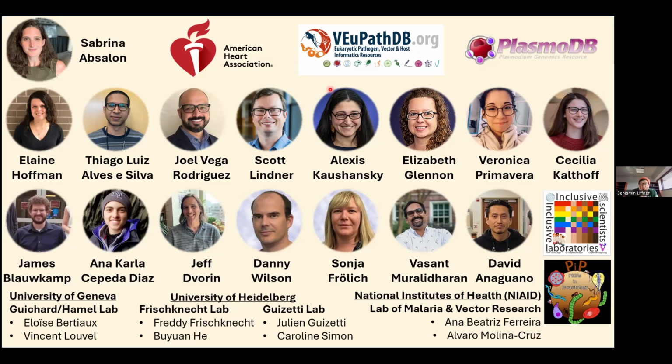Basically, I would put on a few tissues, say a few salivary glands or a few midguts, for each thing that I want to image, and just hope that one of them is in a really nice orientation. The other thing I found is that because we can't really get these things to stick to the coverslips, often our tissue will be floating in the middle of the gel, which is a pain, because if you have a really short working distance objective, then you can't reach it from either side of the gel. So this is particularly a problem with the salivary glands, which are very floaty, maybe not surprising considering they contain saliva.